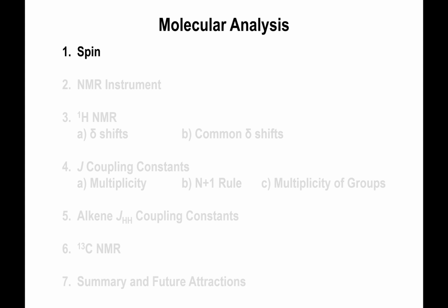and nuclear quantum numbers. As you may recall from general chemistry, an electron possesses a spin quantum number. It could either be rotating clockwise or it could be rotating counterclockwise, and we assign to each one of those rotations a quantum number, plus 1/2 or minus 1/2.